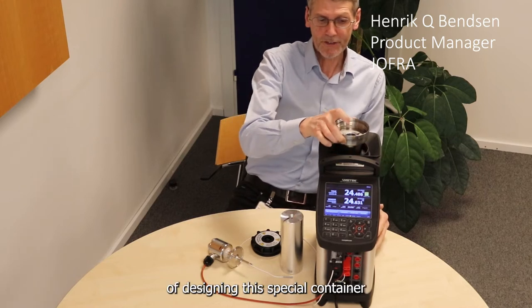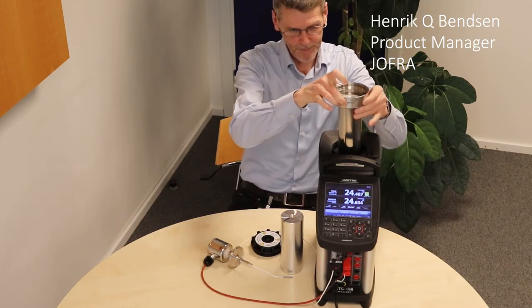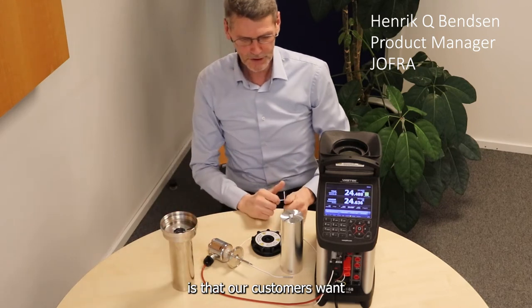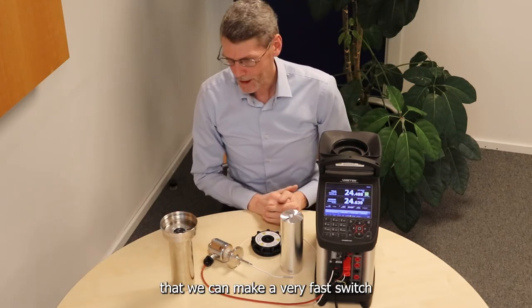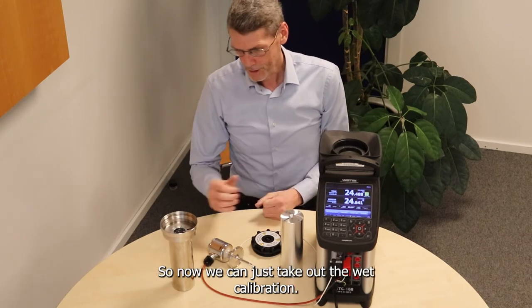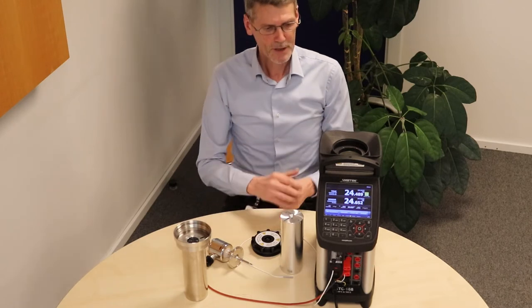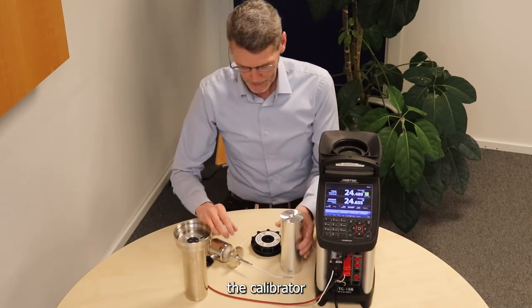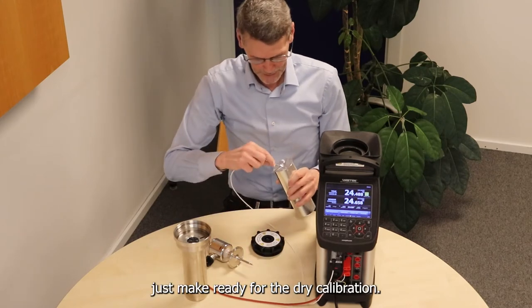The purpose of designing this special container is that our customer wants to make a very fast switch from wet to dry calibration. So now we can just take out the wet calibration — no contamination, no time for cleaning the calibrator — just make ready for the dry calibration.